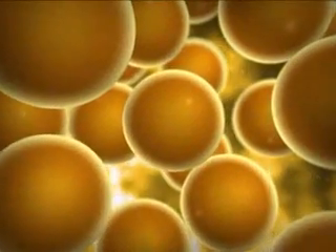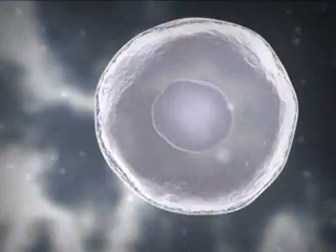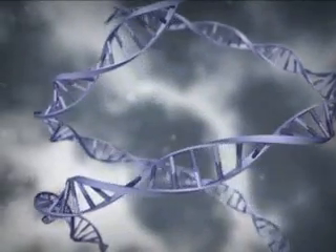Magnetic beads from Dino Biotech provide a better way of separation. Cells, proteins, and nucleic acids are easily purified in a reliable and cost-efficient way.